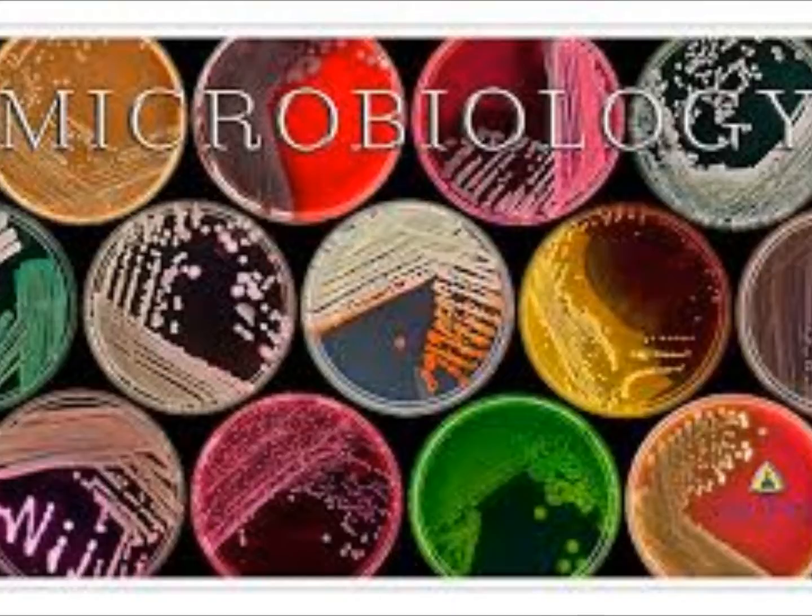When you see a beta colony that's clear, you're going to think strep A, C, or G. When you see a beta colony that might be white on the first day, but then has a buttery appearance or a light yellow on the second, Staph aureus. So the color is another factor. You guys have a plate that's got white, clear, yellow, if you want to look at those.